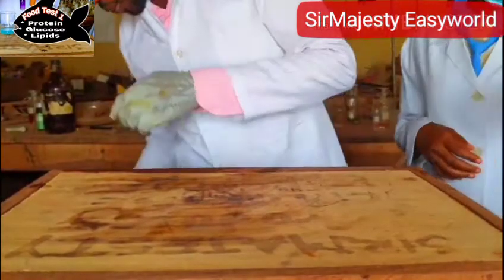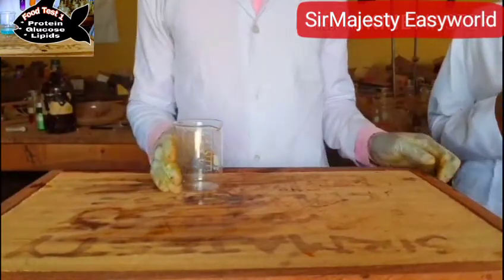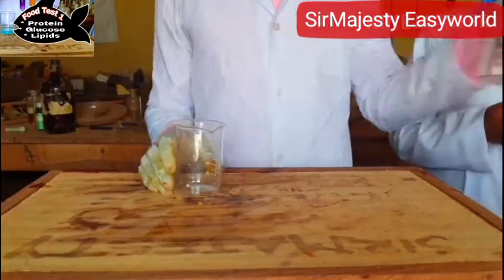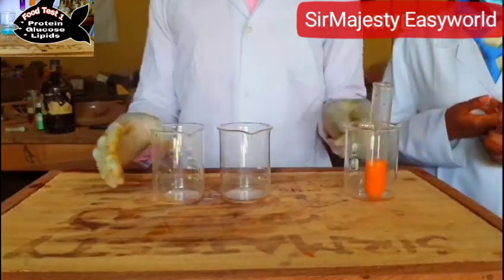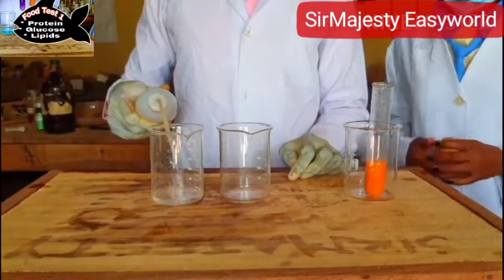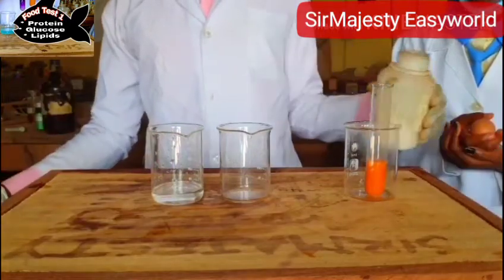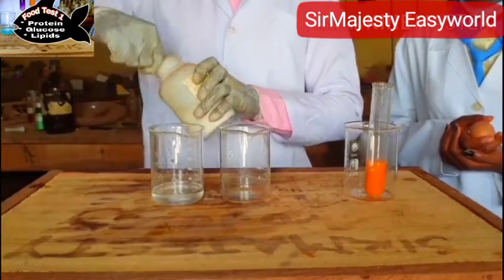We are going to test for protein. We have the Biuret test — that's what we are going to do now. In the Biuret test, you need about 28% sodium hydroxide. I am making the 28% sodium hydroxide solution. Just use strongly concentrated sodium hydroxide.